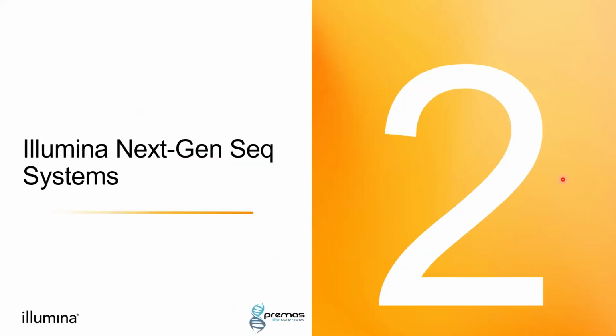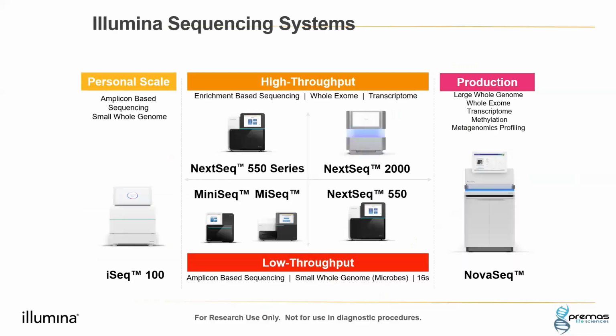So I have given you what edge Illumina NGS offers, and what the workflow is. Now let's understand what sequencing systems Illumina has to offer. We have this range.